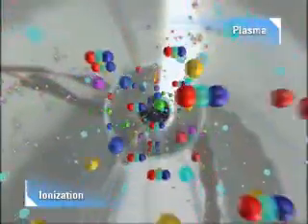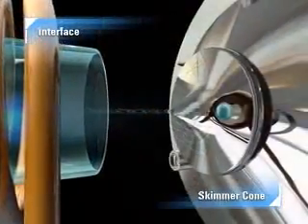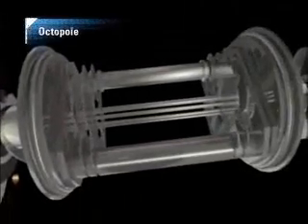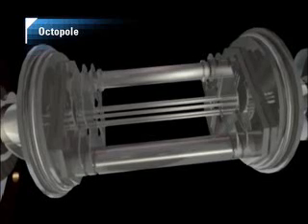The ions are extracted from the plasma into the interface through the sampling orifice, and then through the skimmer cone into the high vacuum region containing the ion lenses and mass analyzer. Electrostatic lenses focus the ion beam and separate the positive ions from the unwanted neutral species by bending them into the reaction cell, the heart of the octopole reaction system, or ORS. The ORS is unique in using an octopole ion guide in the cell rather than the hexapoles and quadrupoles used in other cell ICPMS systems.